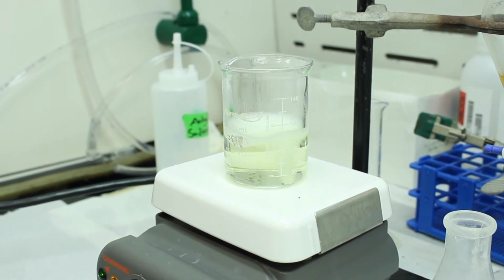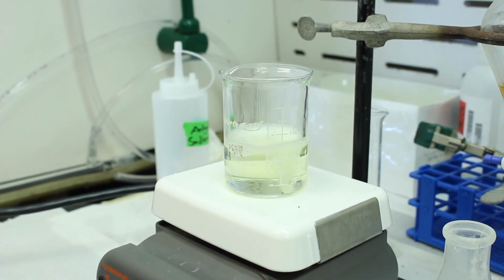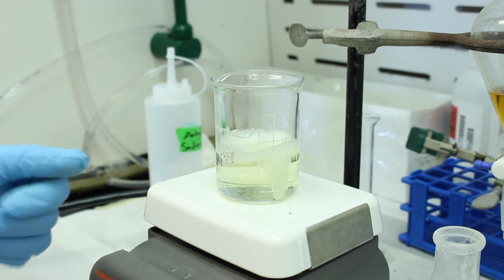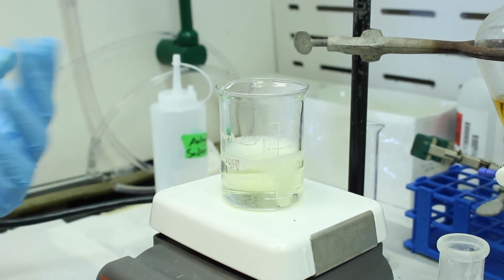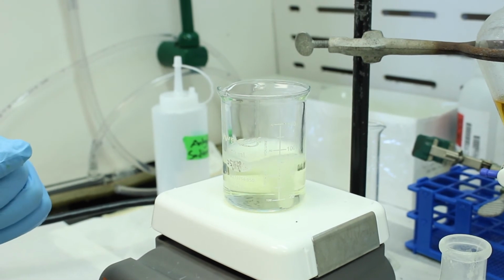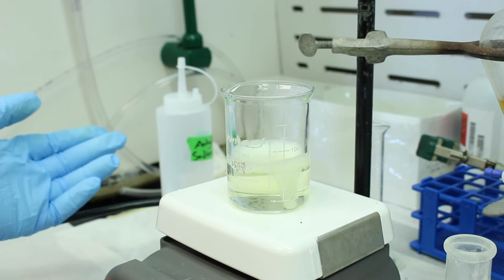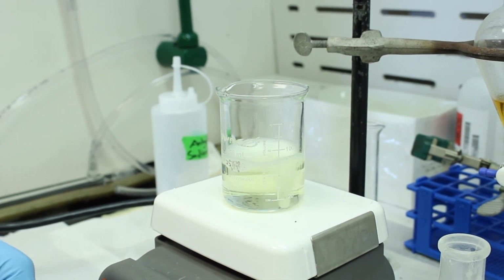And all we have to do is wait. So we're going to wait until we boil off enough solvent so that we have about 10 to 15 mLs remaining in the beaker. At that point, there should be a large quantity of triphenylmethanol precipitate, so most of the ether is gone and it's primarily hexane. In which case we can put it in an ice bath, make sure all the triphenylmethanol is solid, and then filter away the hexane. And the hexane should contain the biphenyl impurity.